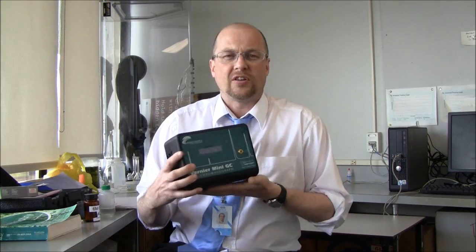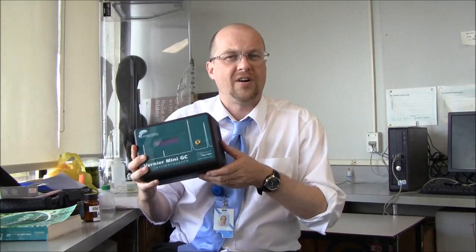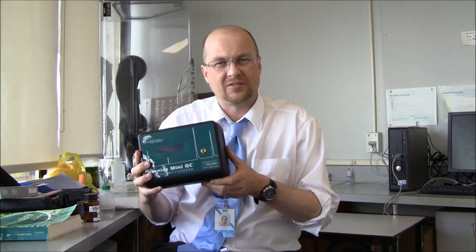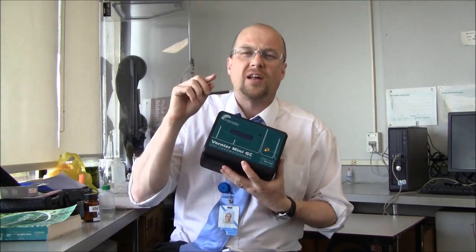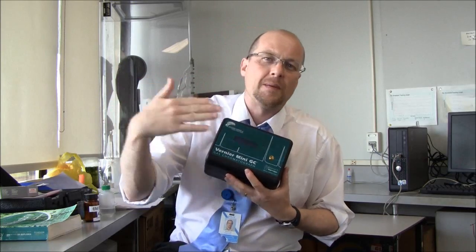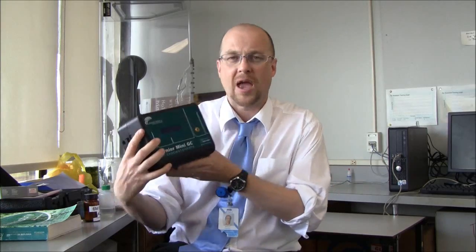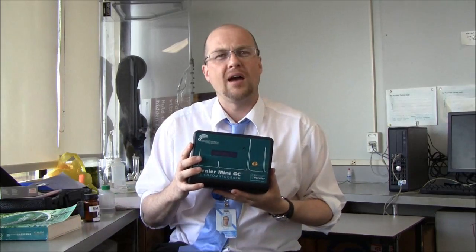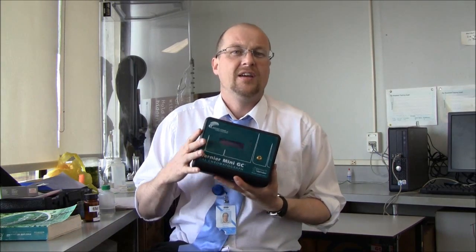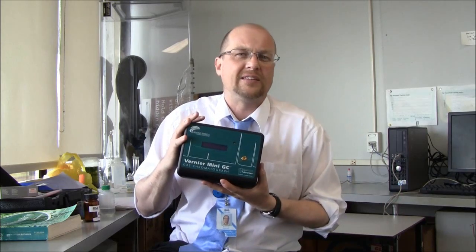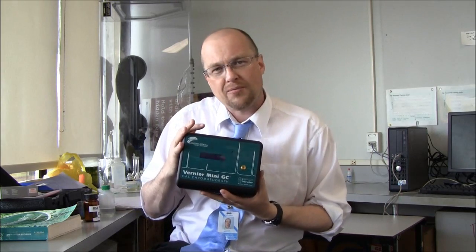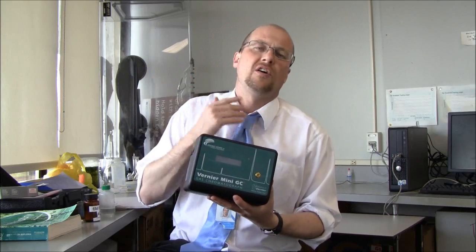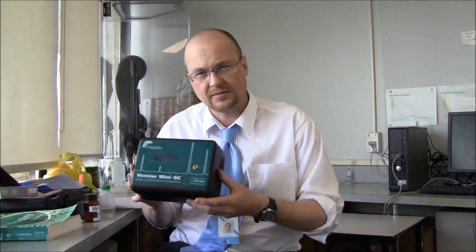So this is very good at separating volatile chemicals out. There's a little ultraviolet type detector at the end of this machine, and the ultraviolet light will detect whether an organic chemical has gone by and leave a peak on a graph. Now, pretty much any volatile chemical will work, and we'll go through in about 8 minutes. It would go through slower, but this also has a little heater, and that combined with the high pressure, or the medium pressure, kind of pushes it along a little quicker than it would do otherwise.